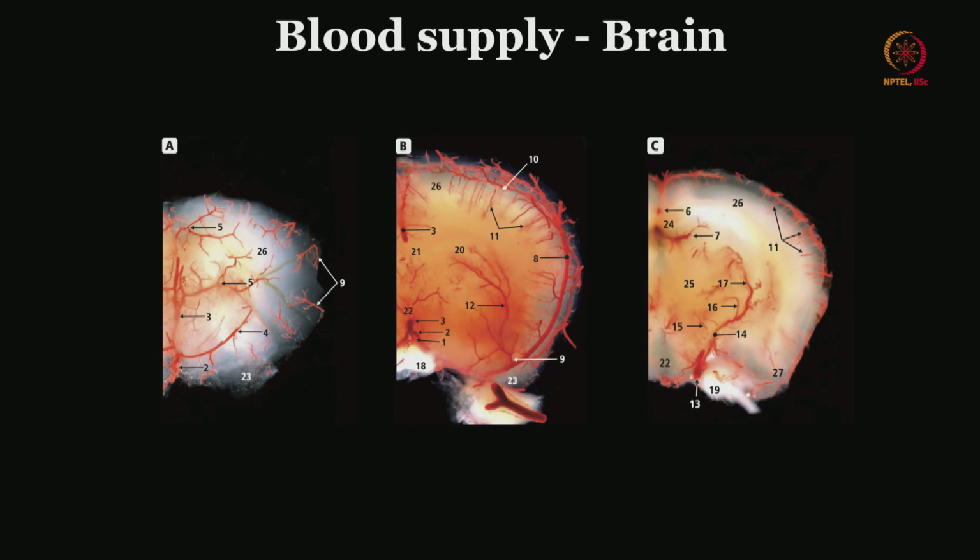So, unfortunately, we do not have image guidance yet in rodent surgery. Most, 90% of the rodent experiments involve stereotactic coordinates, and those coordinates of course are planned to avoid these particular vessels. So, for example, you can see that you can target this lesion by choosing this particular coordinate there, which goes avoiding these bigger vessels there. But there are many coordinates which will take this trajectory, and you might hit these vessels which are deeper, and then the rat dies, mainly because they will be bleeding in that particular region, and it expands and expands and becomes a large hematoma inside, and the rodent dies.